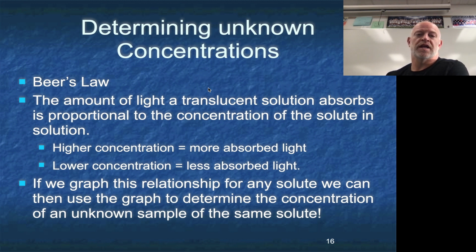Maybe we're working in a lab and we're making up multiple solutions, and maybe someone didn't label something, and we just need to know how concentrated that solution is for whatever our purpose is. Now, to do that, one technique we can use is called Beer's Law. Okay, we're going to use Beer's Law as in a laboratory setting.